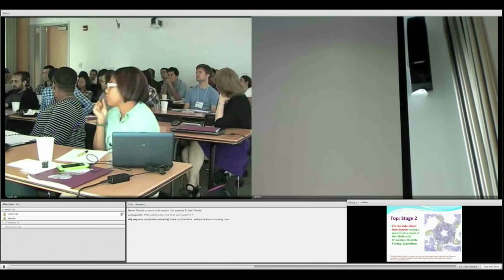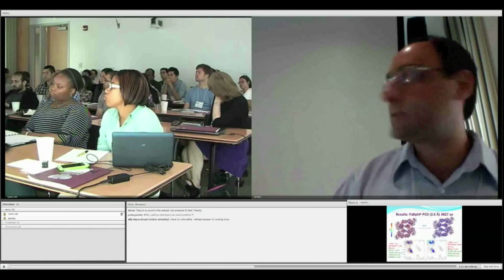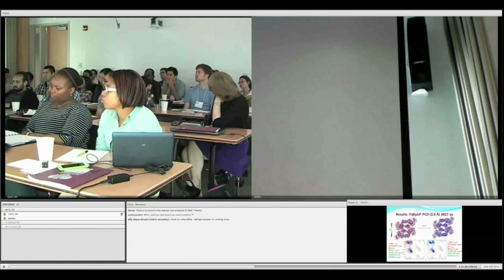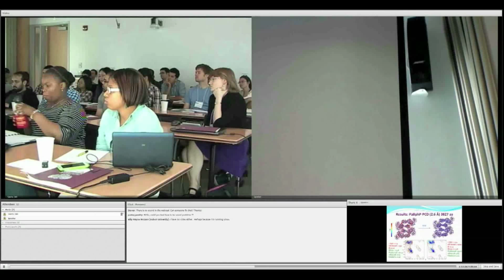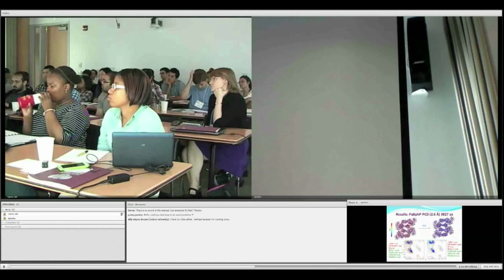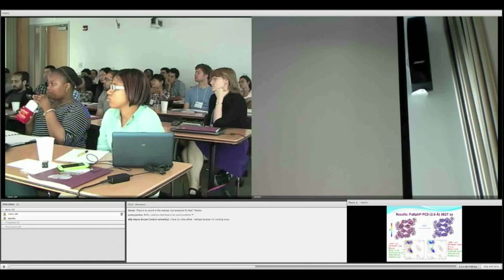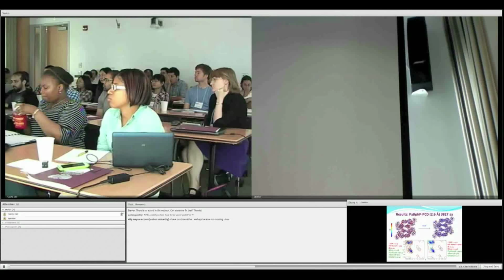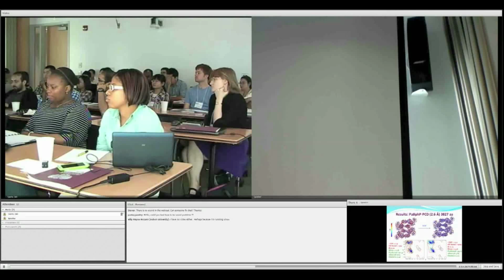So, how well does this work for a resolution of 3.2? Well, we use our Rama maps for our TSP3 for 2.2 because those are more certain values. But this works very fine, as I will show you some results for higher resolutions. So pretty much we use 2.2 as our cutoff, because anything above that we consider not as good. And as I showed you, for the lower TSP value there is a nice correlation between the TSP and the resolution.